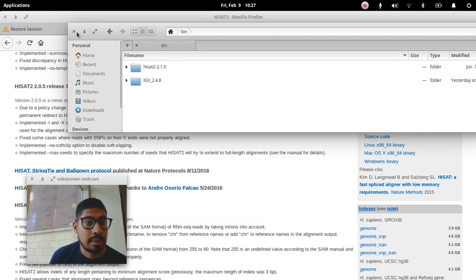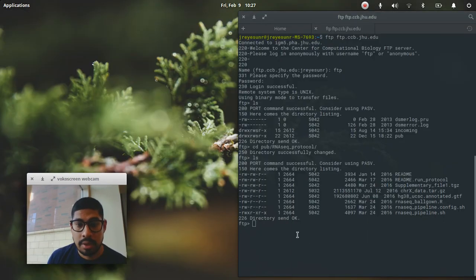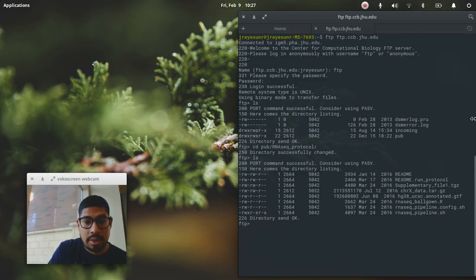Now in order for that to run, we had to set that up with a path. So we had to put that into our path, and what I did was I can actually close this connection since I already have that data, so I'll just do exit.